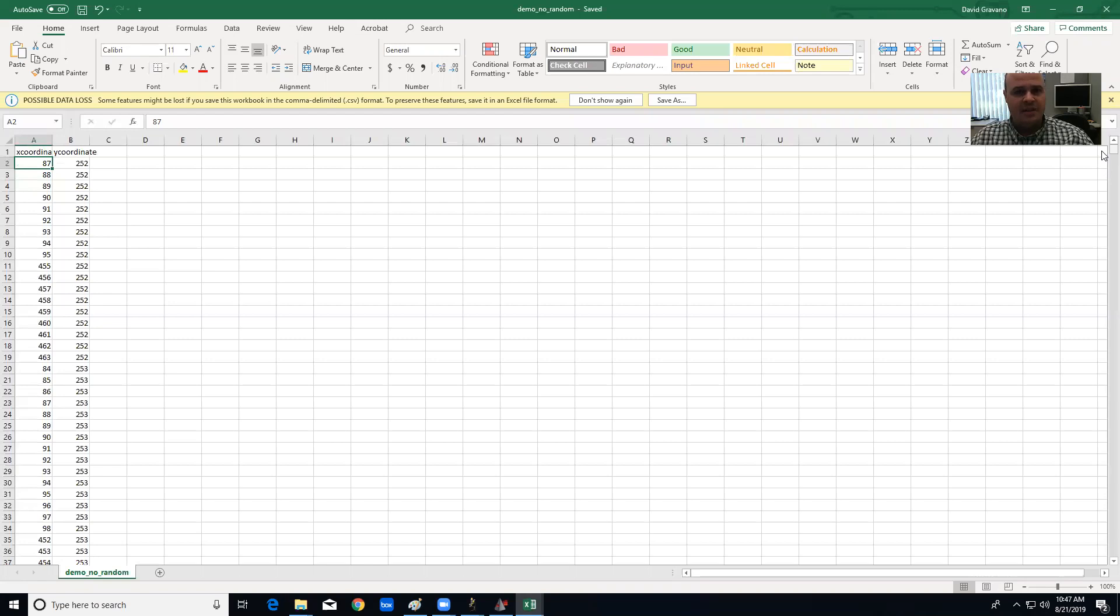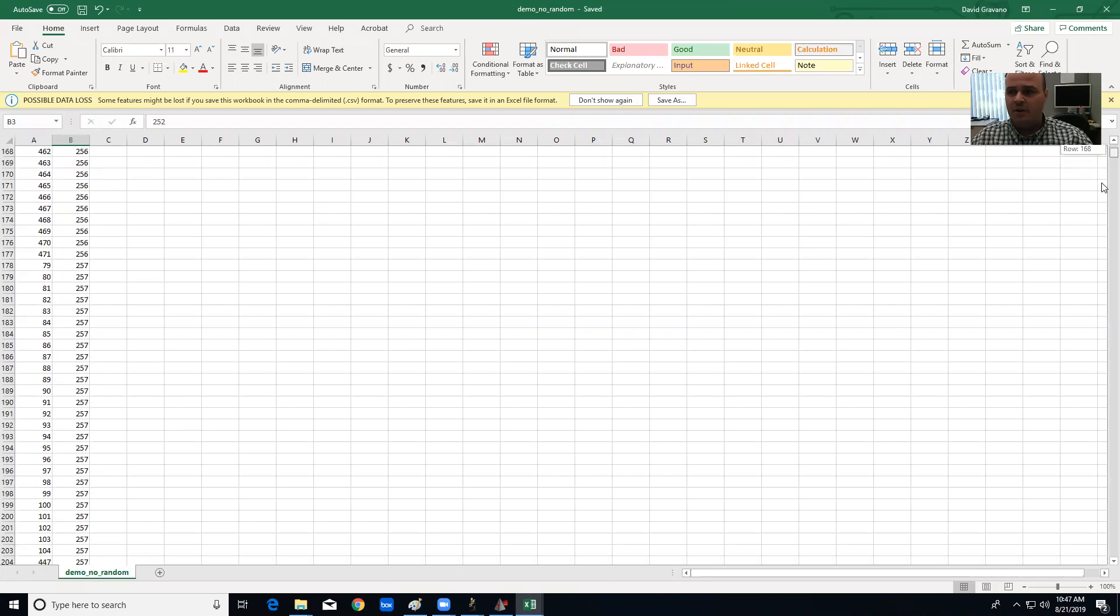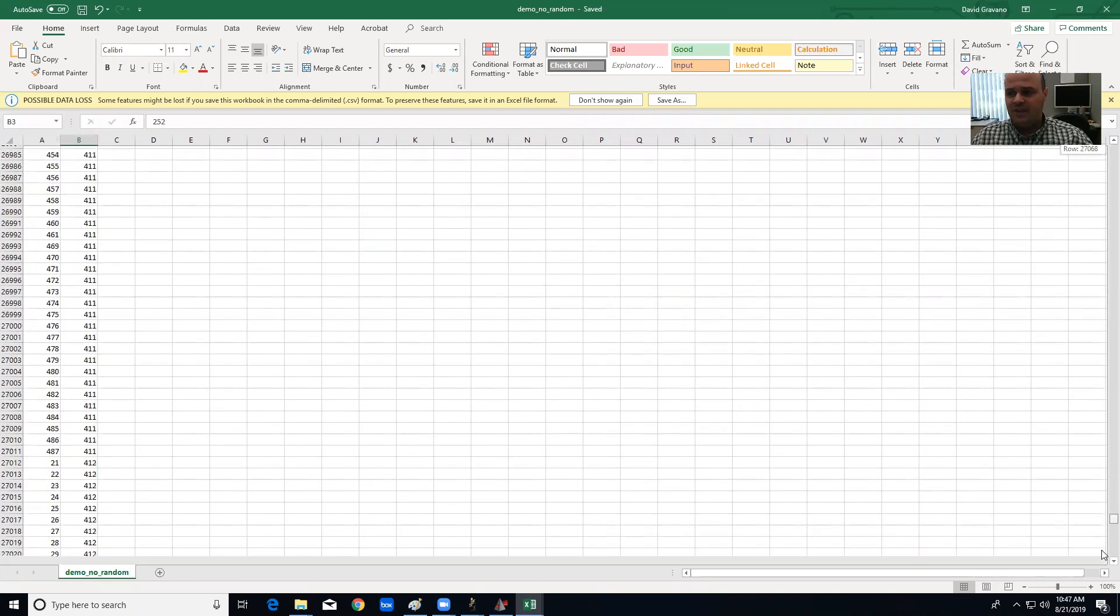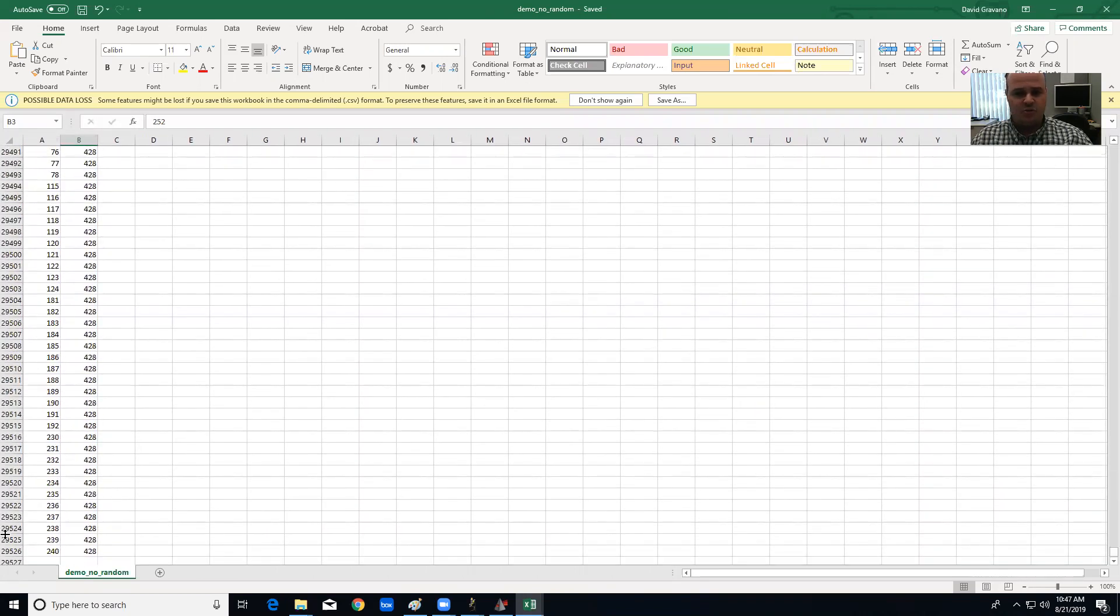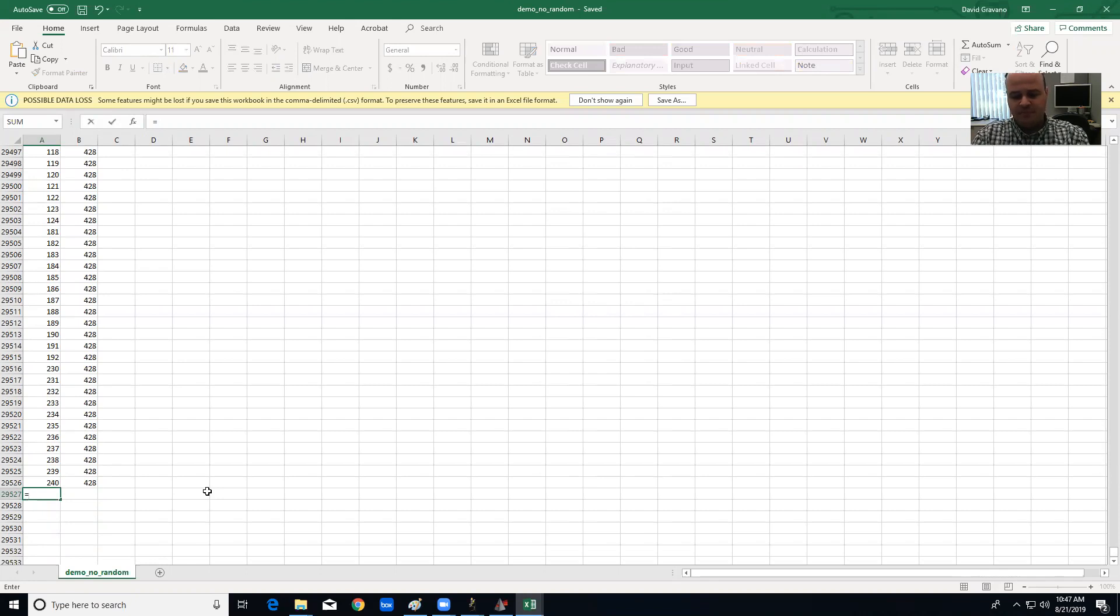The next thing I'm going to do to include some random data points and give it a little noisiness is I'm going to scroll down all the way to the bottom. For me that's there's 29,000-ish rows of data, and in the first empty cell I'm going to type the equation equals A2, that's my first cell of data, plus.